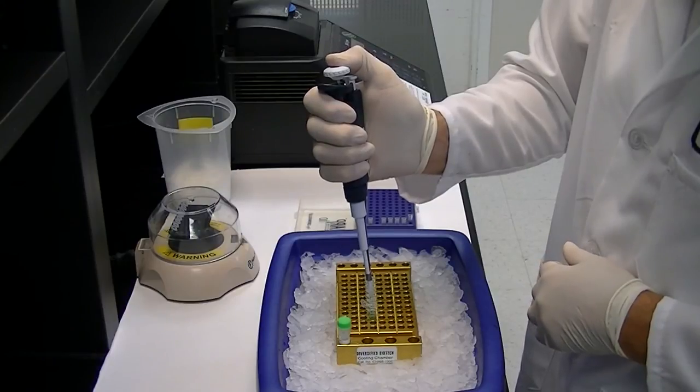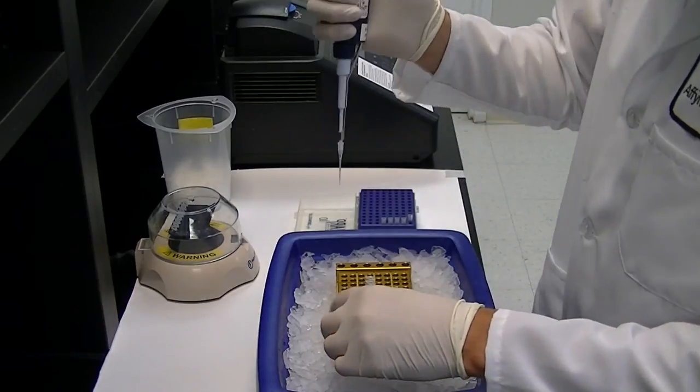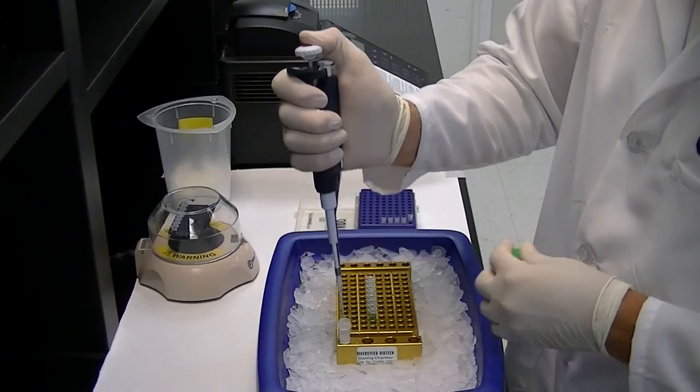Mix the reaction by pipetting up and down or gently vortexing. If processing multiple samples, as shown here using an 8-tube strip, keep the reactions on ice until complete.